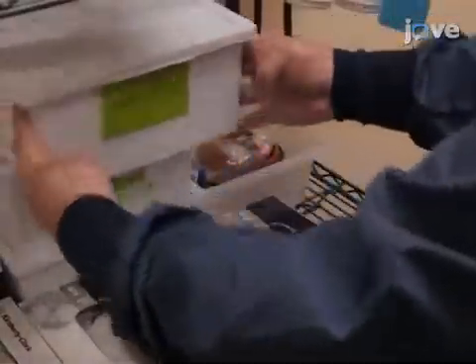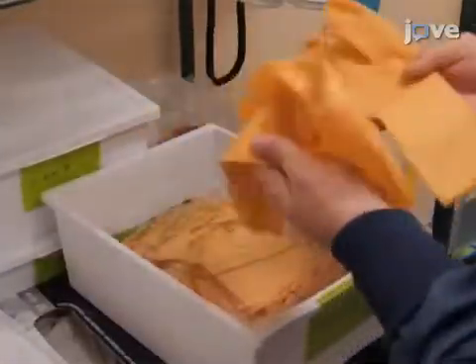Change gloves at least every seven calendar days or if damage to the gloves is identified. To replace the outer suit gloves.